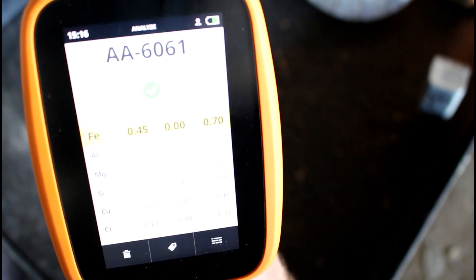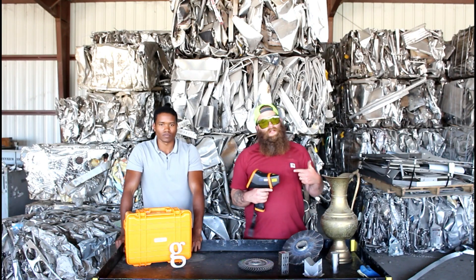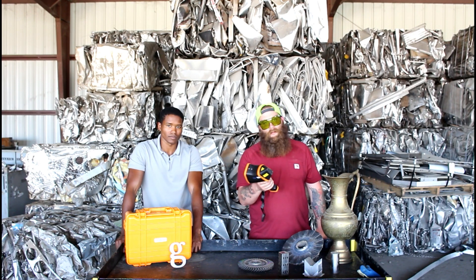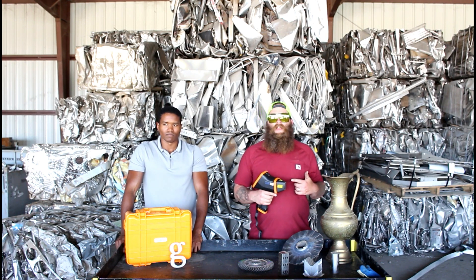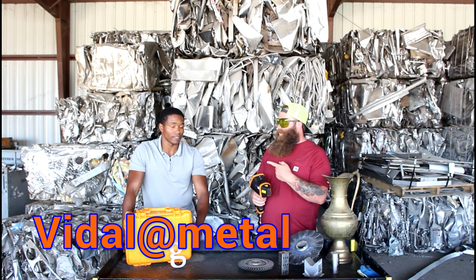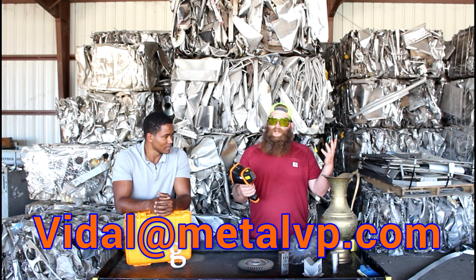Looks like the letter G is a 6061 aluminum. So that was a short look at what this thing can do. I really like this product — and I'm not just saying that because I spent money on it. I think it's a good product, or else I wouldn't be making this video. If you guys want a demo of this thing, Vidal will come out and demo it for you. You can contact him at vidal@MetalVP.com.